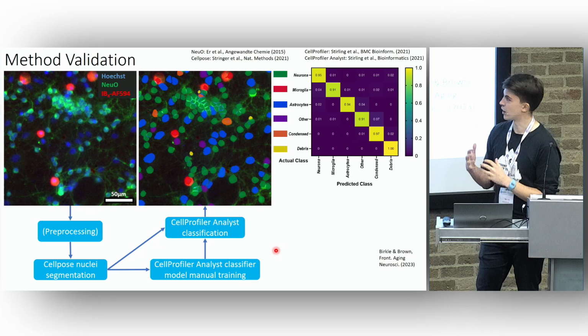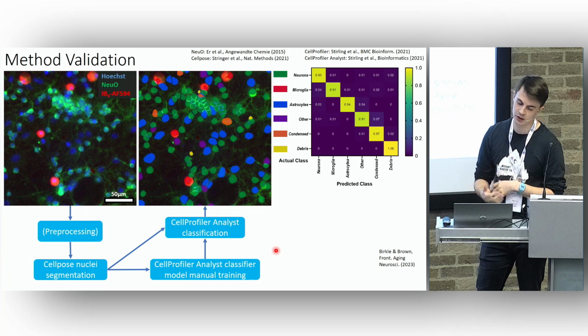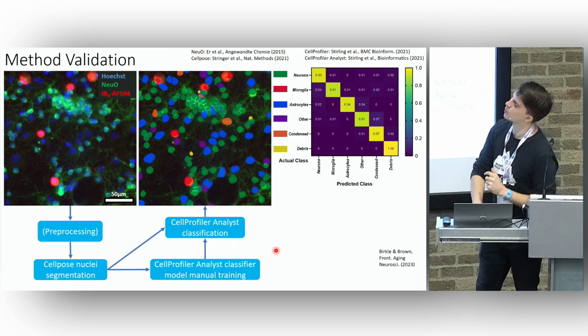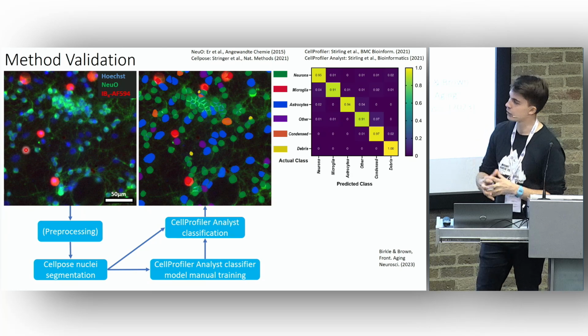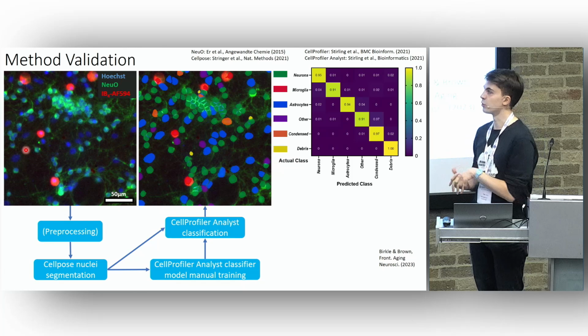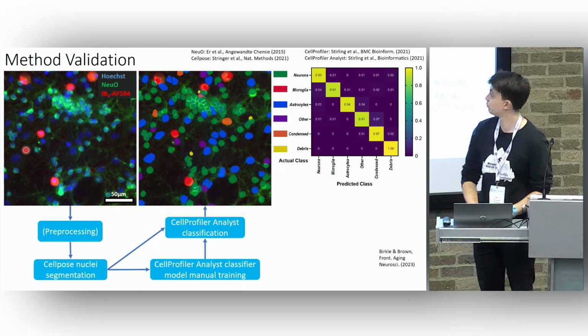that proves quite challenging with relatively dense, complex cultures like this, where you have cells overlapping, and particularly for other cell types like the astrocytes, which you can see in the background with relatively large and diffusely stained nuclei. Then you're really relying on relatively low signal-to-noise features, which proves challenging for a standard analysis.